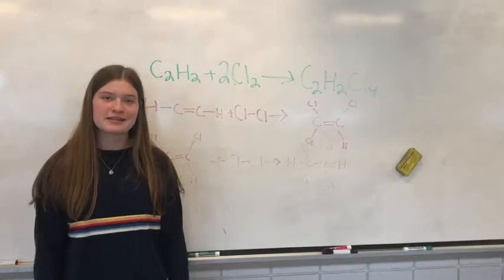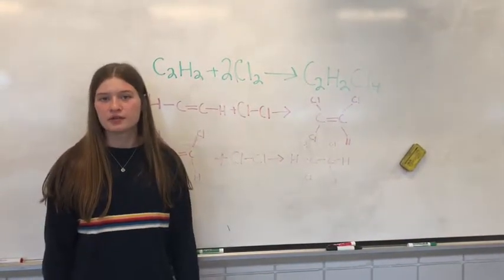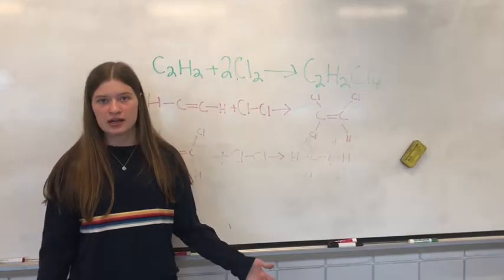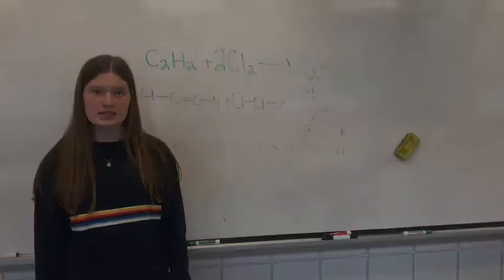This reaction between the acetylene gas and the chlorine gas has a low enough activation energy that the room temperature in the lab is high enough for this reaction to occur spontaneously.